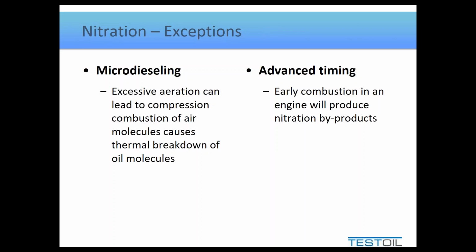If we're dealing with a combustion system, the timing being advanced can lead to greater nitration. And this was an interesting side effect that was noticed in particular by Dr. Barry Hertz from the University of Saskatchewan. They did a study on biodiesel in transit buses. And biodiesel was being investigated because obviously if you have heard anything about biodiesel, it's that it has better emissions and to some point better fuel economy.